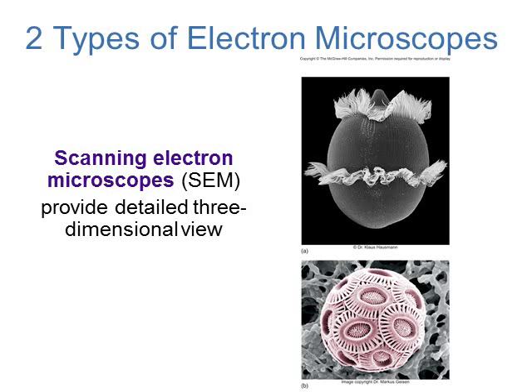The other type of electron microscope is called a scanning electron microscope, abbreviated SEM. Scanning electron microscopes scan the outside of the cell, so you get this really cool 3D image. And a lot of times they'll add artificial color to these 3D images, and they can be very, very cool and interesting to look at. And I'll try to incorporate some of these into lectures when we start getting into cells and looking at different types of organisms.